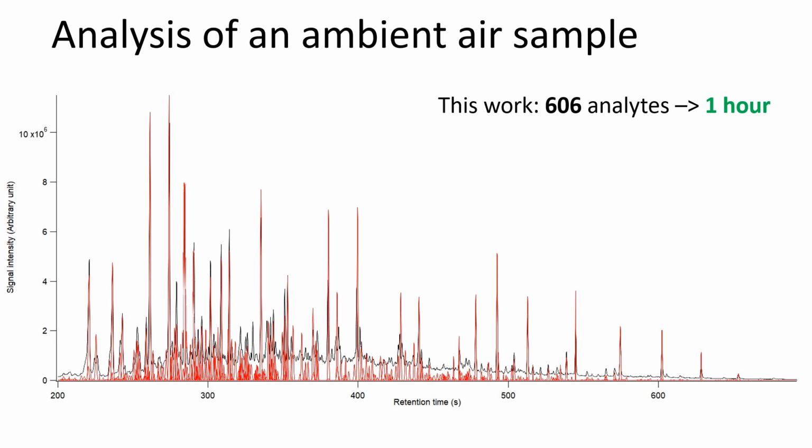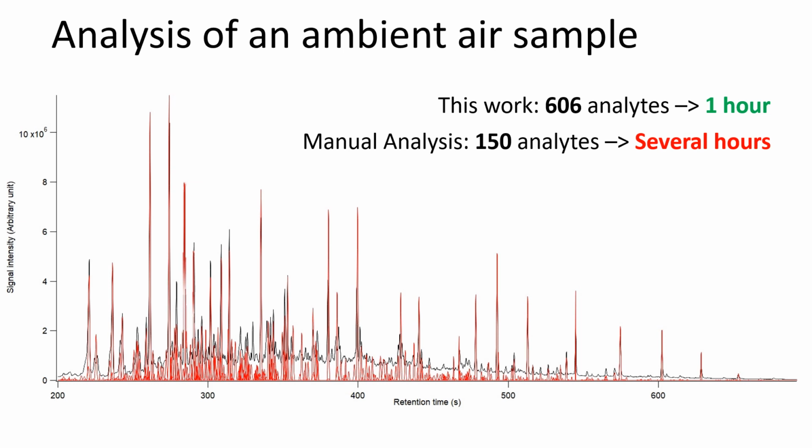These results show a significant improvement in analysis efficiency when compared to the conventional manual analysis of the same dataset performed by a skilled technician, which yielded approximately 150 analytes in several hours.